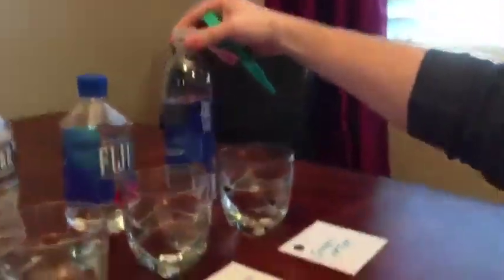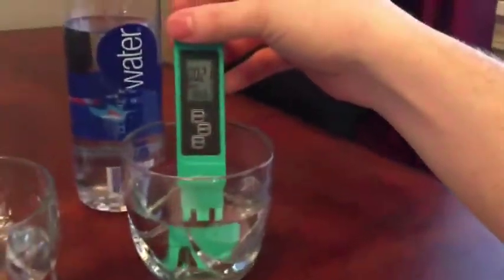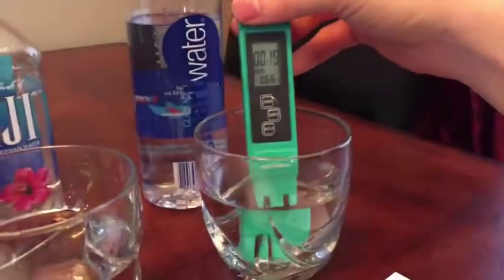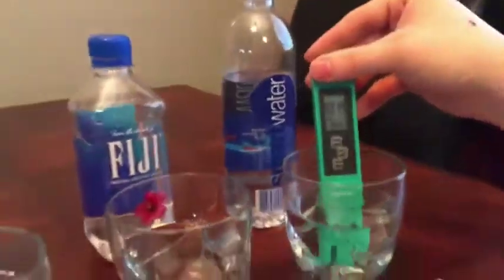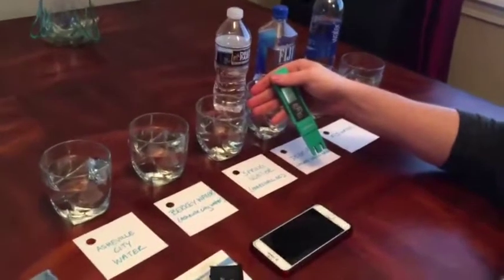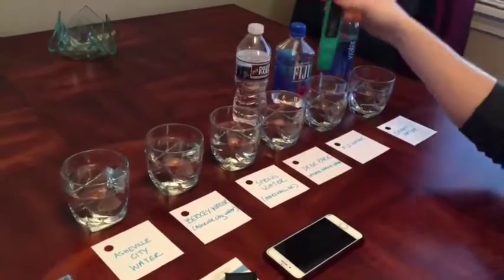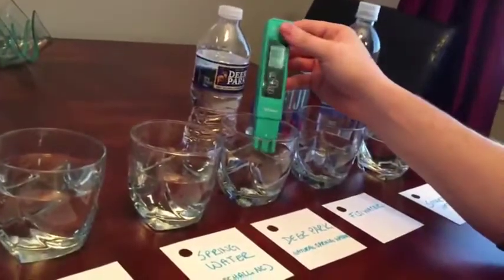Finally, let's test Smart Water, which is reading around 19 to 21 parts per million. So there you go — this shows you how essential this tool is. If you can't access spring water directly from the source, this meter will help you discover which bottled brand is actually going to be a safe choice. It is definitely working very effectively and I highly recommend getting one.